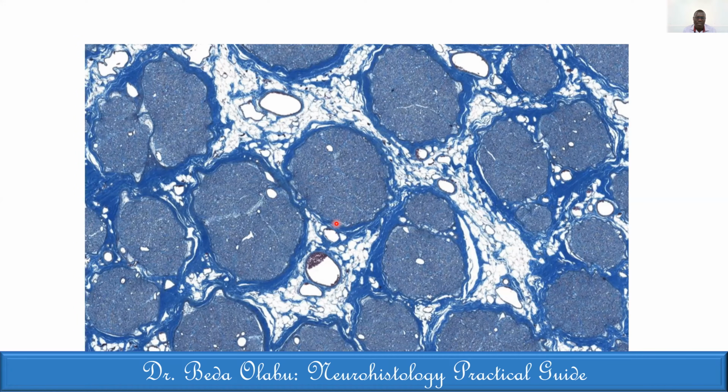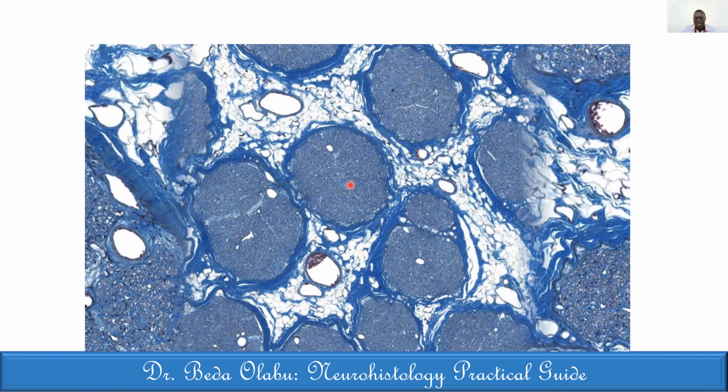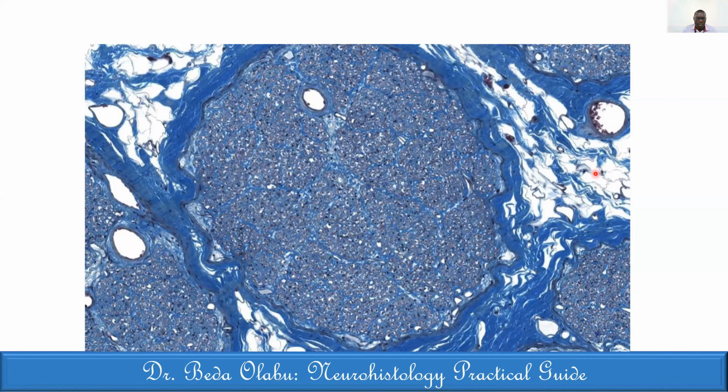And so these are the various fascicles of the nerve processes that we have within the peripheral nerve. A higher magnification still reveals further the adipose tissue and the connective tissue elements that we see in a peripheral nerve.